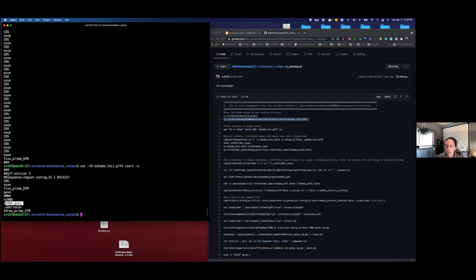So whenever it finds something based on your RNA-seq that looks like a gene, it matches it to whatever database you tell it to. So in our case, it was Uniprot. And if there's not a match there, it tends to just call it a non-coding RNA, which is a little weird because it could really legitimately be a gene. But just something to know if you're using this tool.